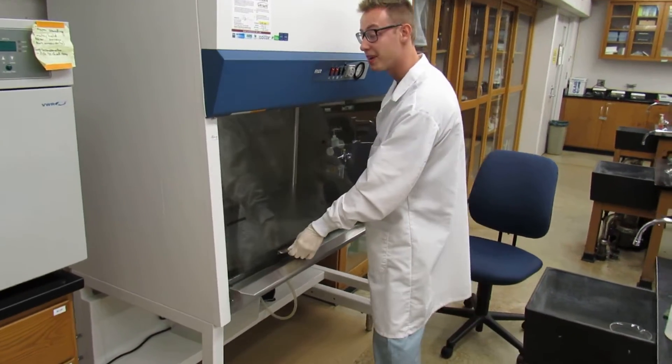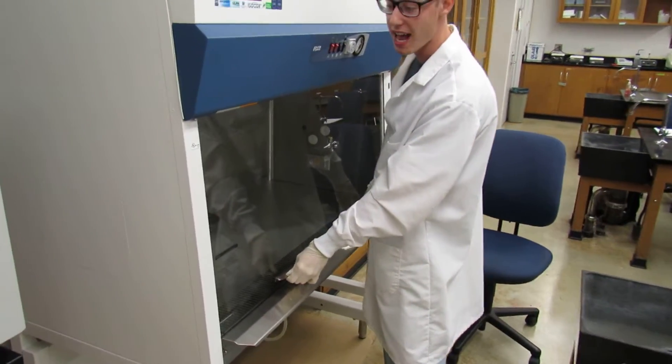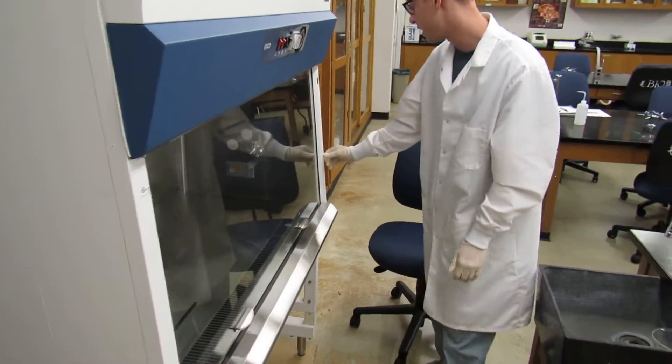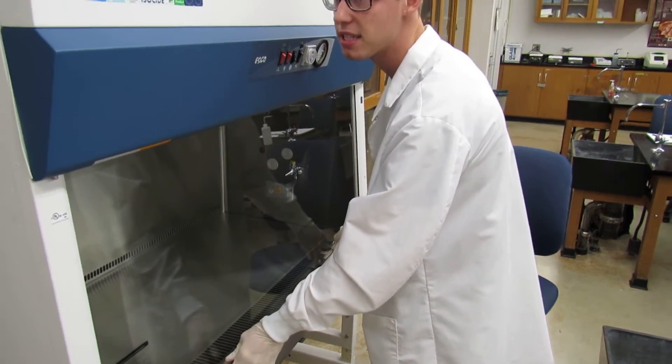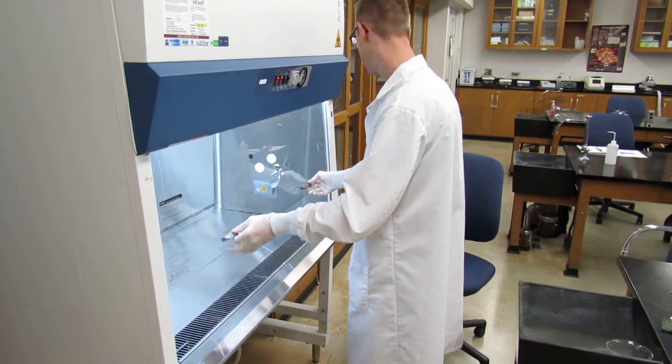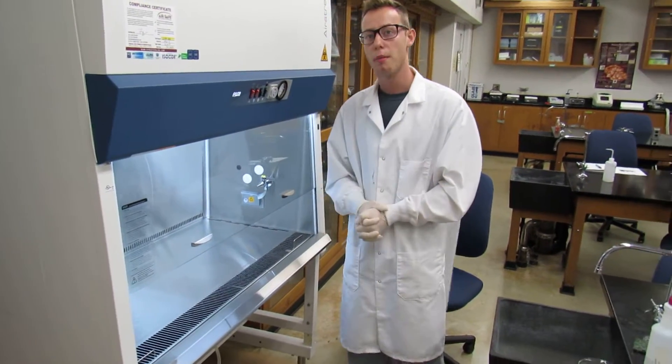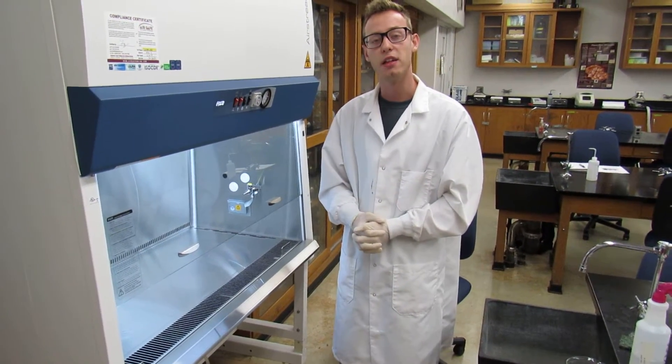The biosafety cabinet is this right here, and you're going to want to raise the sash until you get to this mark right here, the sash height line. You're going to raise it until the lights of the cabinet turn on. The cabinet will keep alarming until you've reached the proper height and the lights have turned on.